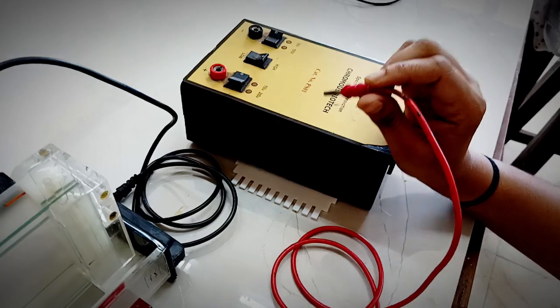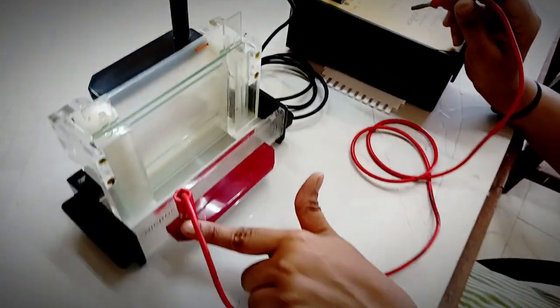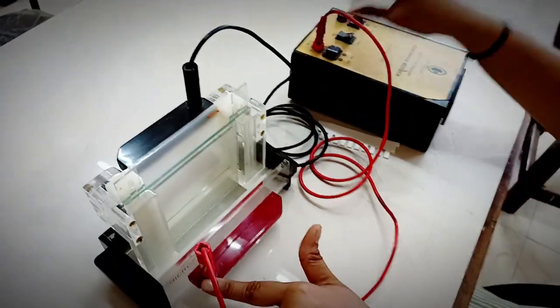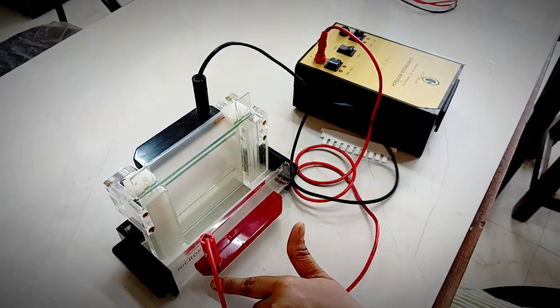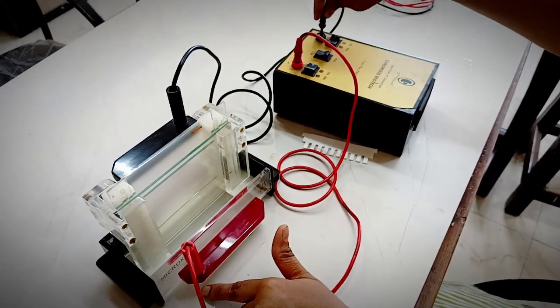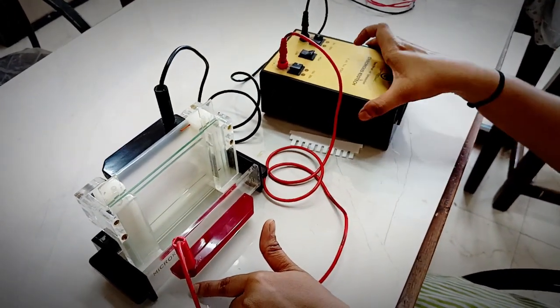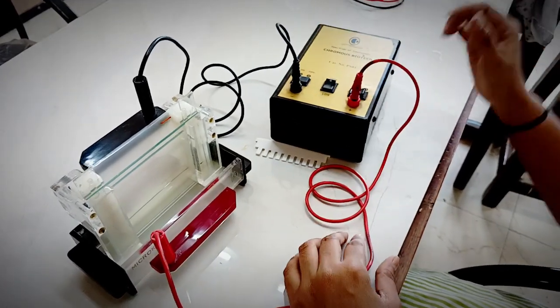This is called the power pack. Now you are going to attach this red electrode to the red electrode and black to black electrode.